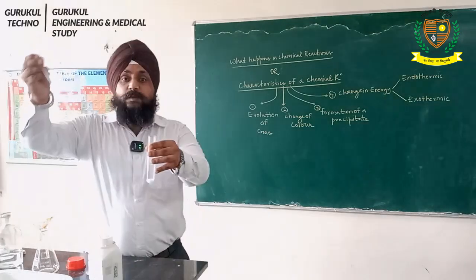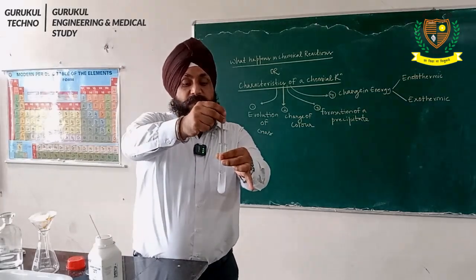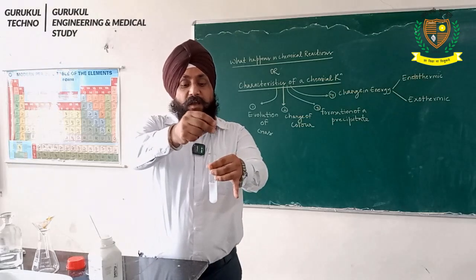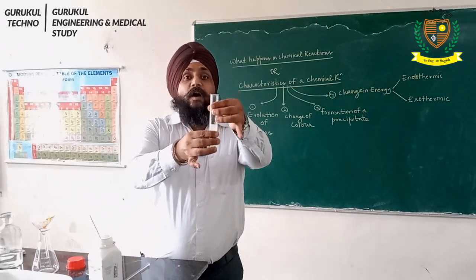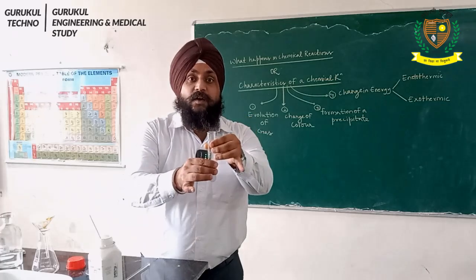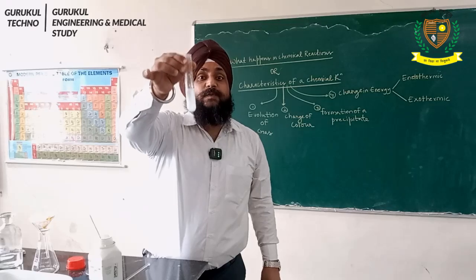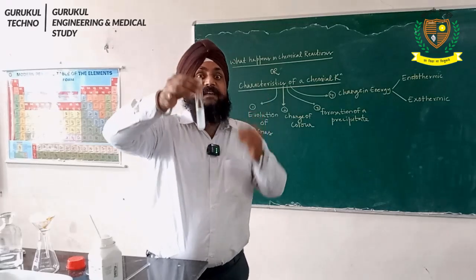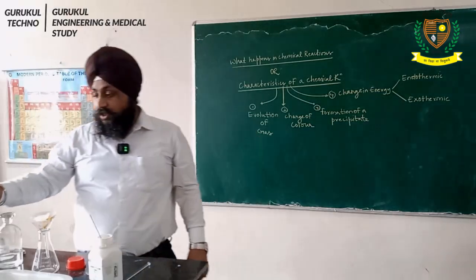With the help of a glass rod, we will stir it nicely. We can see that it has dissolved in this test tube, and now the test tube has become hot. So which reaction is it? It is an exothermic reaction. Heat is given out. There is a change in energy.